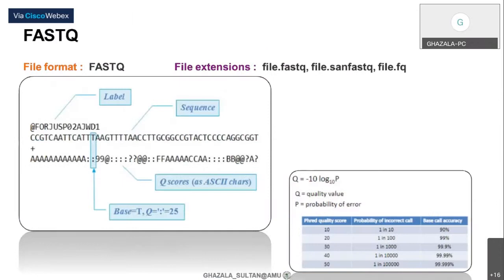So these are just the basics of file formats, where FASTQ format is also there, where the quality of the sequence, and specifically of each nucleotide, is also given. You can see there are four lines in FASTQ format, where the fourth line corresponds to each nucleotide and its quality, and it is mentioned in ASCII characters. There is a different meaning for each symbol, special character and alphabet, so we can see in ASCII characters what these characters are exactly.